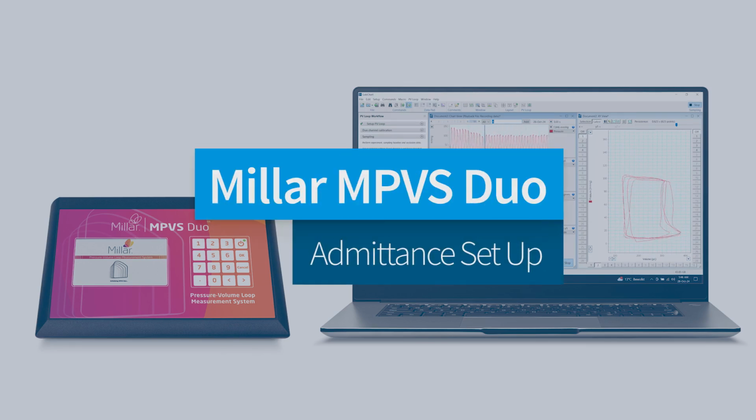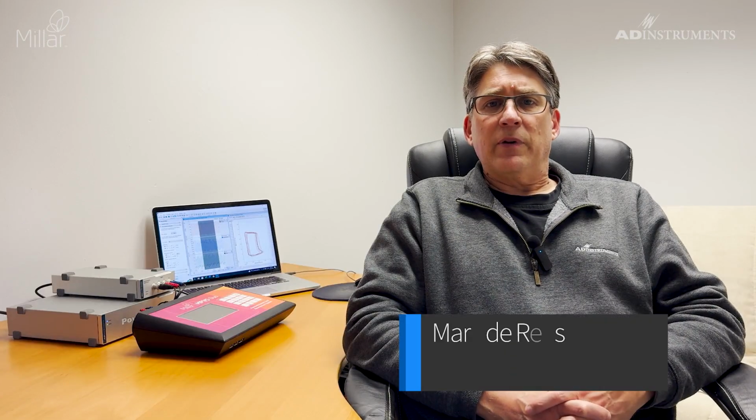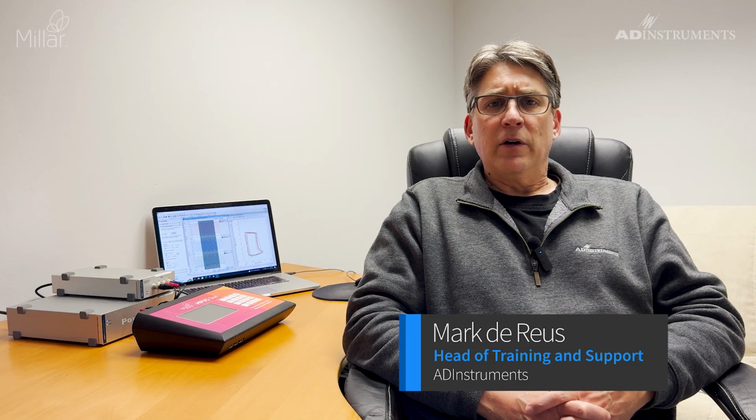Hi, I'm Mark, and I'll be demonstrating how to set up the MPVS Duo and LabChart for PV recordings in small and large animals using the admittance method.